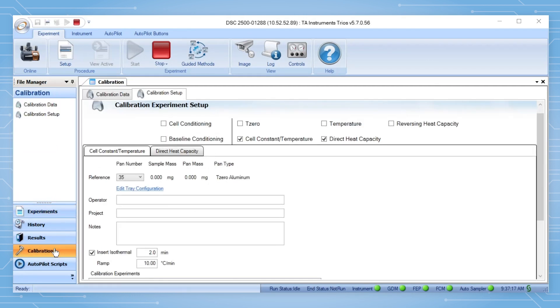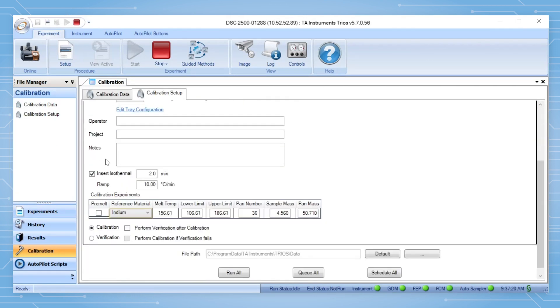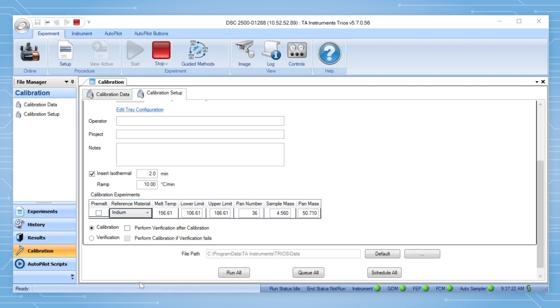Once the new standards are added, they will be populated in the standards drop-down menu in the calibration window.